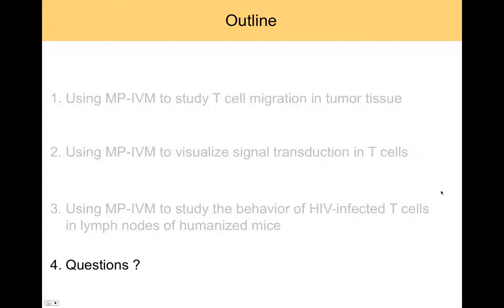So you basically see quantitative relationships. You see things play out in different ways in vivo, and often you see behaviors that actually were not predicted from in vitro studies. So you see complexities that reveal characteristics of the immune system and important regulatory processes that cannot be discovered and cannot be replicated in vitro. So I think this is where much of the value comes in.